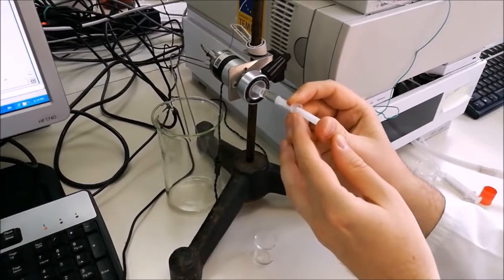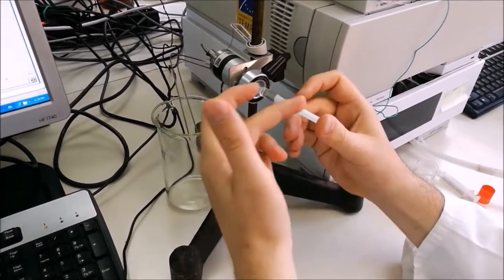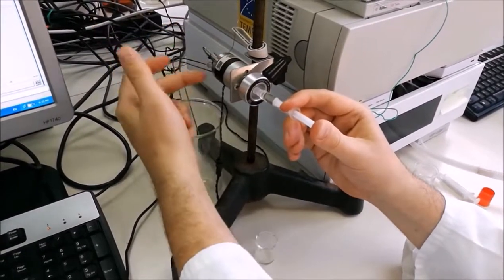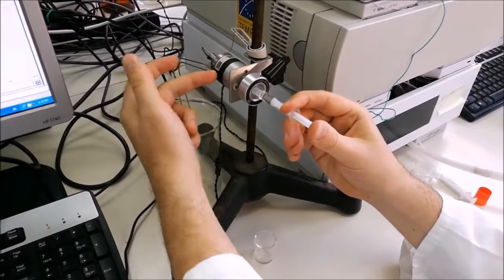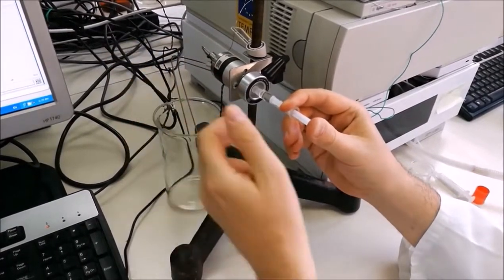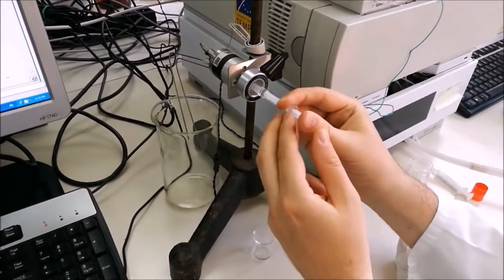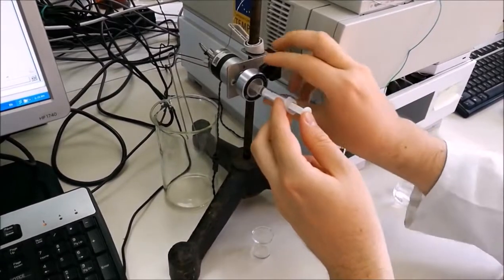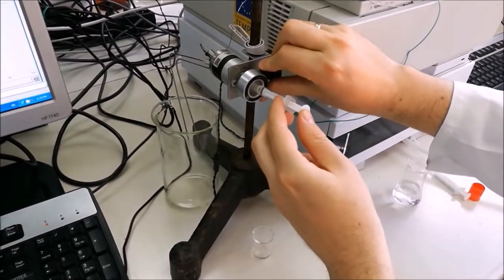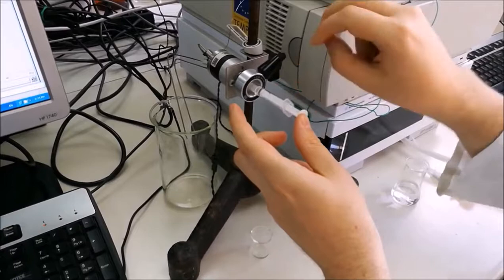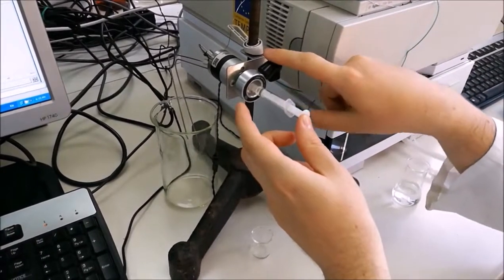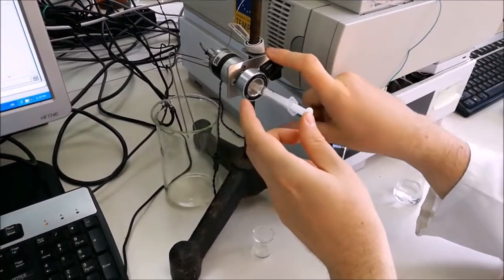We inject the sample into the loop, so the sample will wash and fill the loop. The extra will just go into the waste. And when we are sure that the loop is completely filled, we don't pull out the syringe, and we switch the valve to inject position.